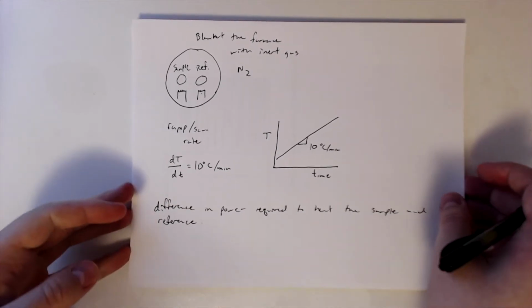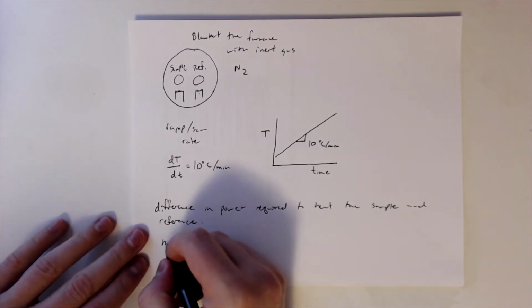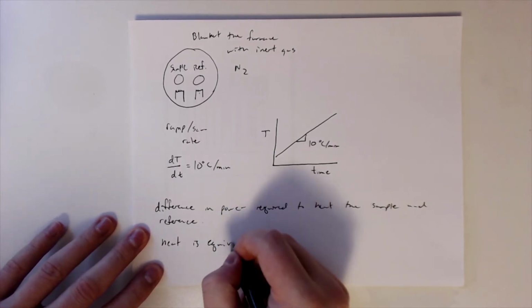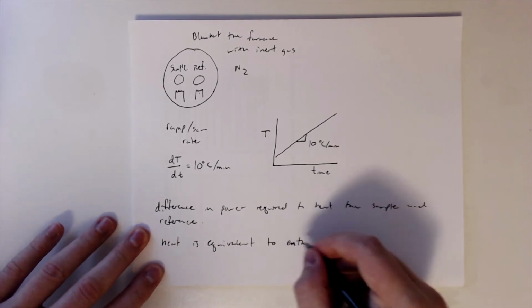And the reason this is useful, the reason we measure this, is because this heat that we're putting into the system, this power that we're putting in, can be thought of as heat. And heat is equivalent to what we call enthalpy from thermodynamics.